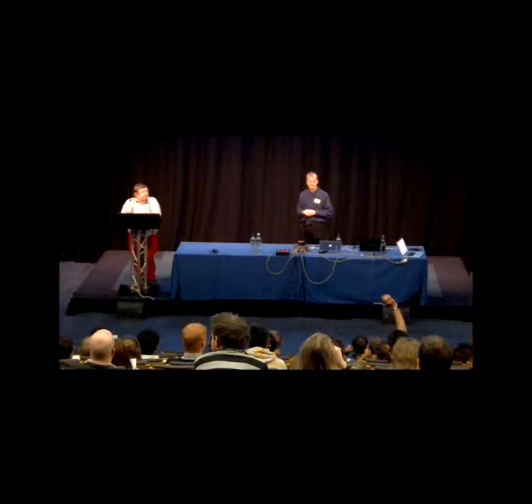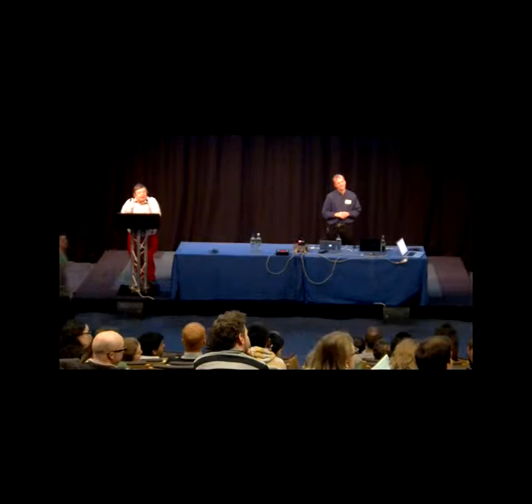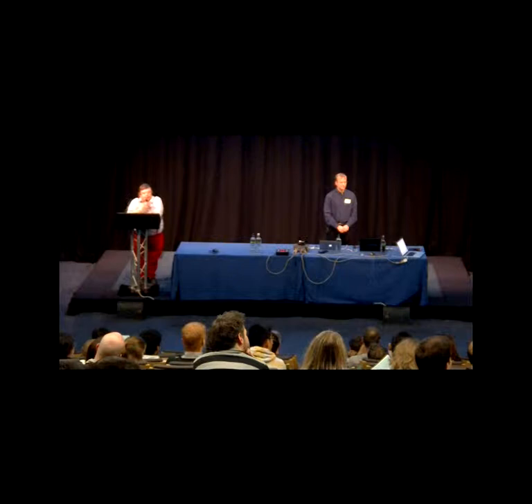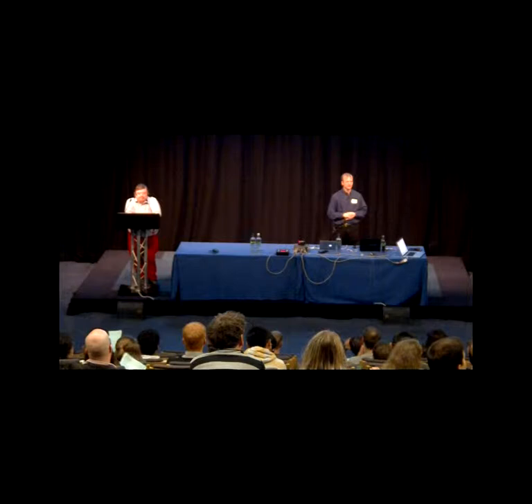Any more questions? Randy. Yeah, I'll just go quickly. Since morphing is so much faster than MR Rosetta, are you going to put morphing into MR Rosetta because it wouldn't actually change the runtime very much, but the combination might be more powerful? Yeah, it's a good point. I haven't done that. Morphing is in AutoBuild. You can do that by default if you wish. But to do it before MR Rosetta, no, we haven't done that. It's a good idea. We could try that.